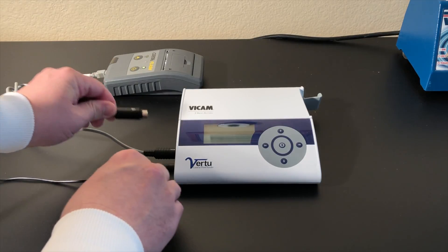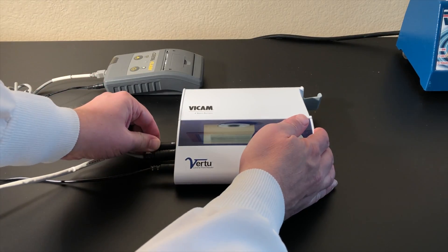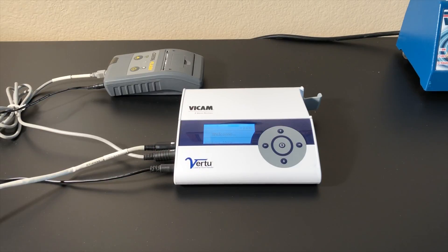Attach the power, printer, and barcode cables to the left side of the Virtu Quantitative Strip Reader. Press and hold the center button to power on the reader.